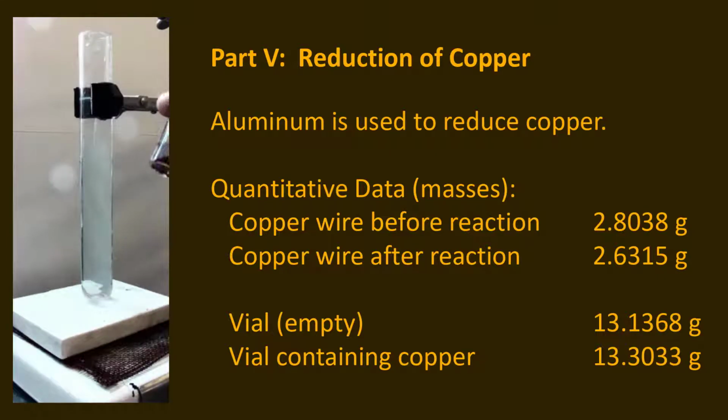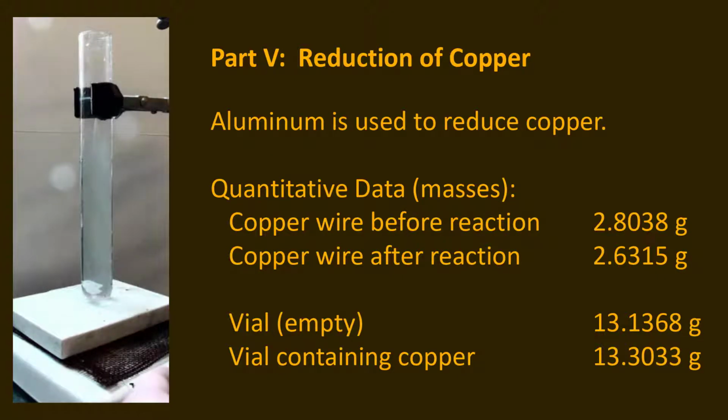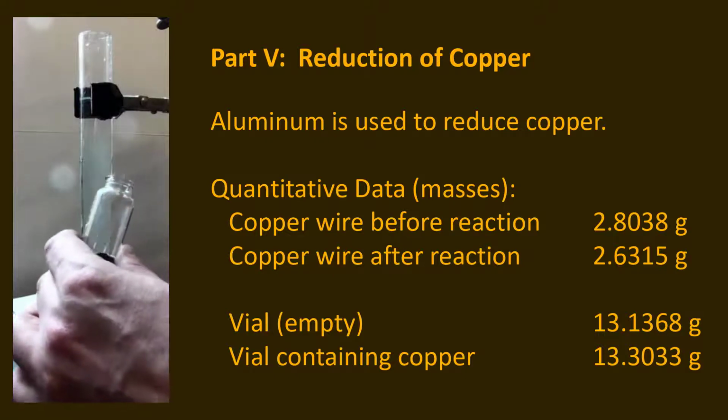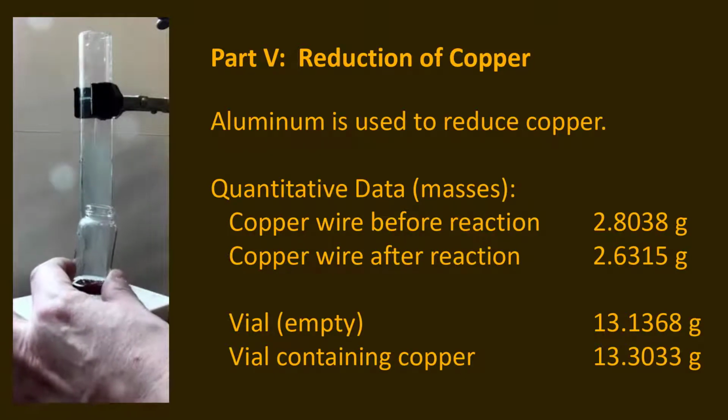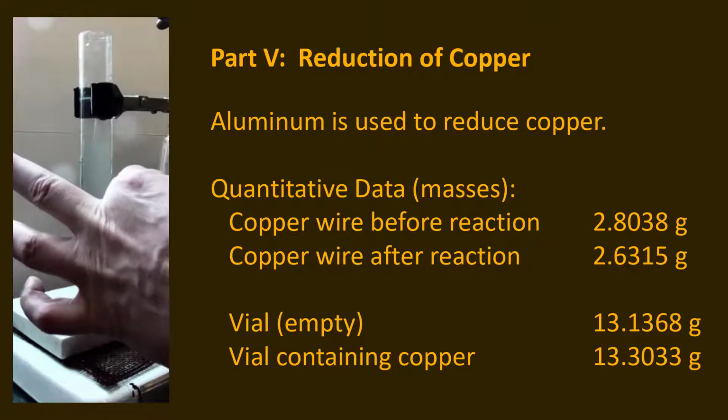So here's my product, and I'm going to just take the water off of the top of it using a pipette. And then I'll add some water to it again.